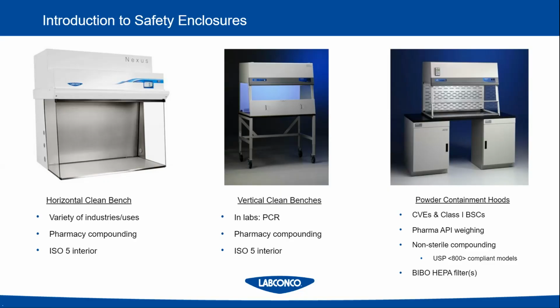And then finally on the right is a Class 1 biosafety cabinet, also called a powder containment hood or a containment ventilated enclosure, depending on the setting. This is where the HEPA filter is on the top, air is drawn inside from the lab and then exhausted through the HEPA filter out to the environment.